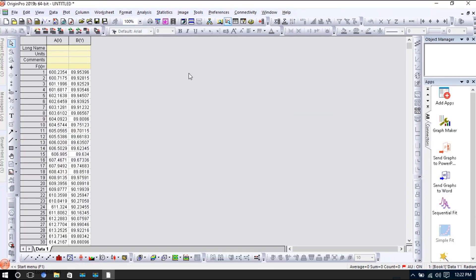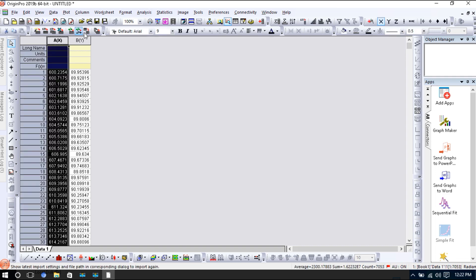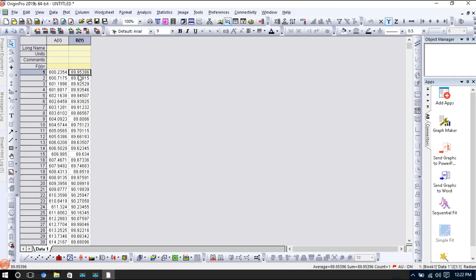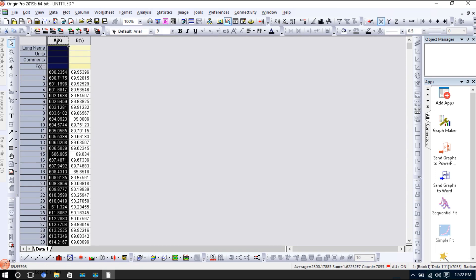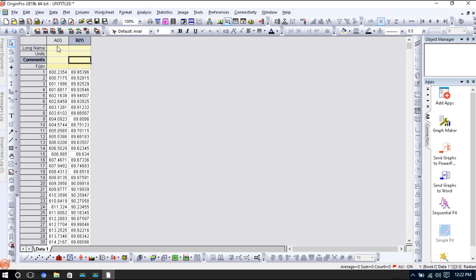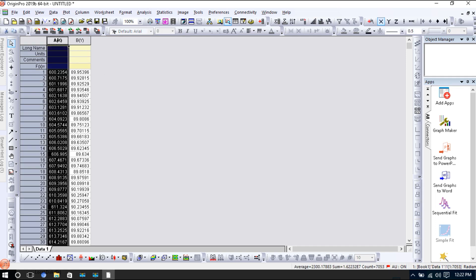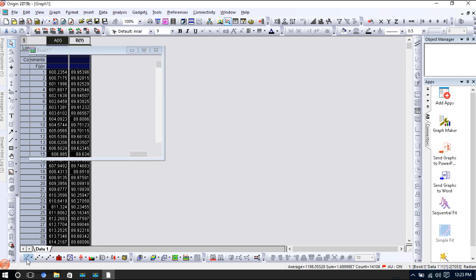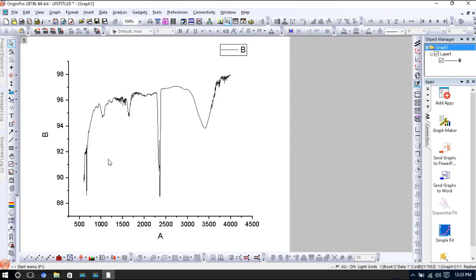This is FTIR data which is obtained from the FTIR machine or spectrometer. It is very easy to plot this data. Just click this, then press the Control button, and then press this again. My all data is selected. Then we will just click this line. Look at this, my FTIR data is plotted.